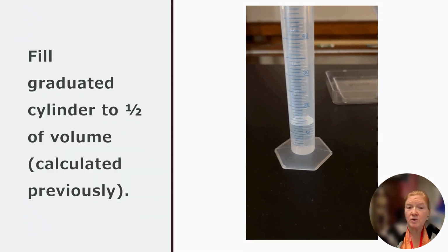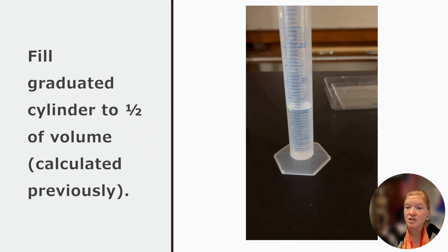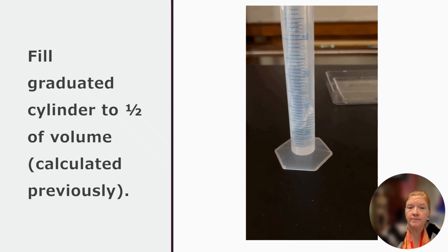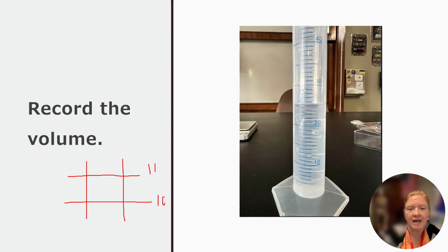Now I'm going to fill the graduated cylinder to half of the volume. Remember, I calculated that earlier. Again, it doesn't need to be exact. It's just going to be close. Then I'm going to record the volume. Remembering what I said before, I'm looking for whatever lines are on the graduated cylinder. So if I have a line for 11 and a line for 10, and I'm going to look for the meniscus. So let's just say my meniscus comes like this. It's not on 11, but it's pretty close. So I might say that is 10.8. Okay, so I need a decimal.